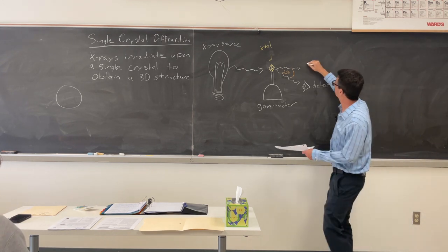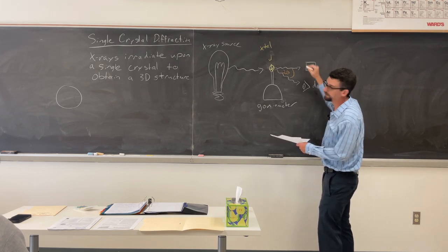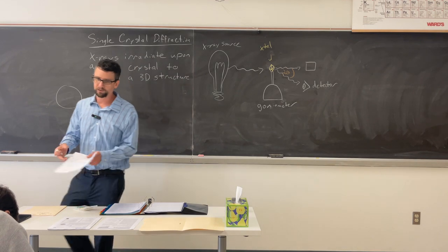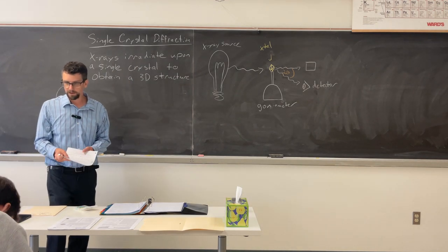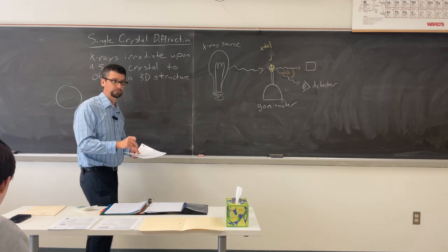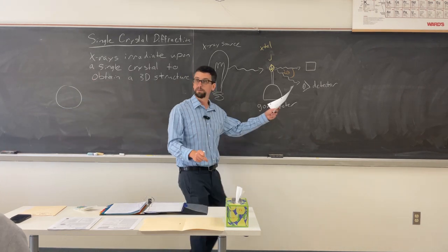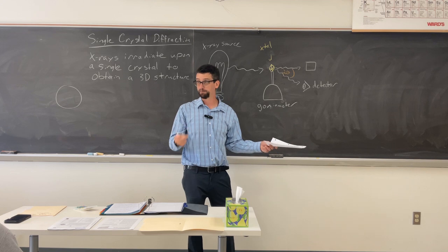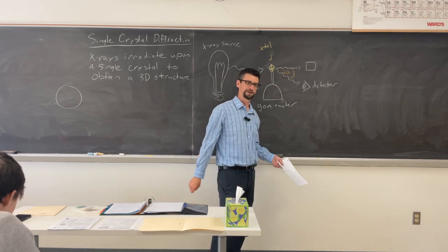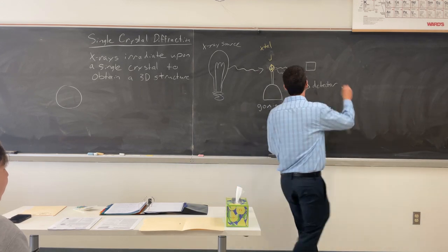So what we do is we legitimately put a block here. So now look back at your other picture where it's that film. Katie mentioned the black spot in the center, right? That black spot is from this. It stops the beam. Scientists aren't creative in their names. What do you think that thing is called? Beam stop. It's a beam stop.